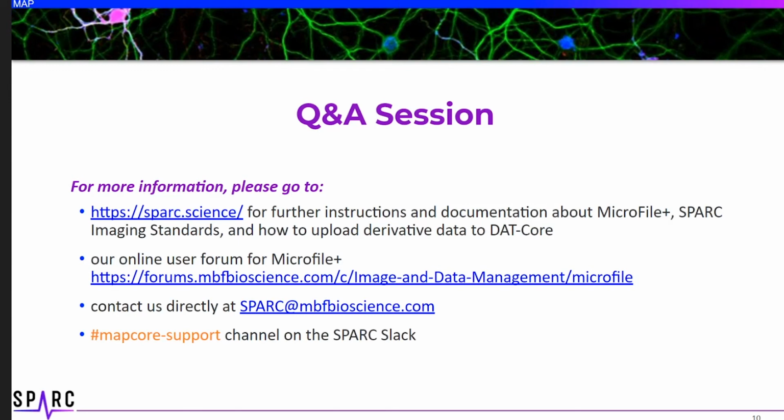There is one thing about using the data that you've generated yourself, where the metadata that is present is something you're already aware of, what the labels are in that image and what the scaling is. And so if the image data actually has that information recorded, then that's great.